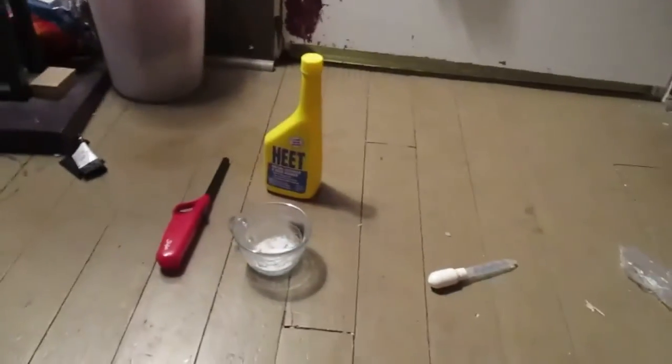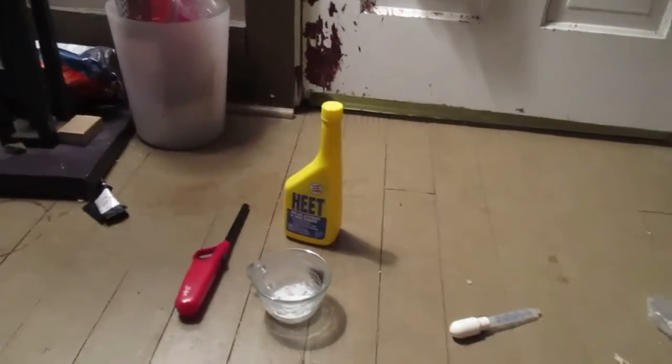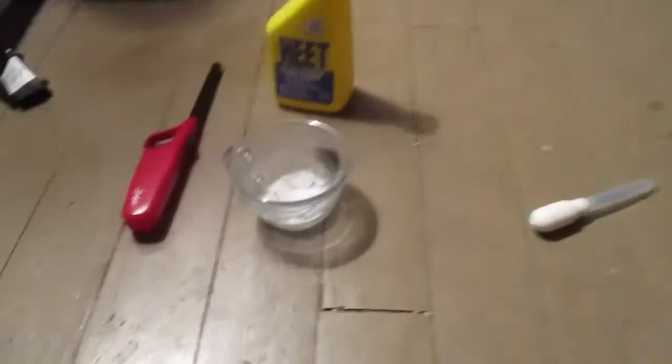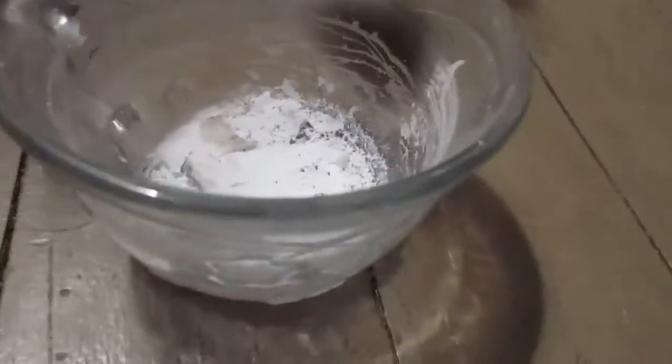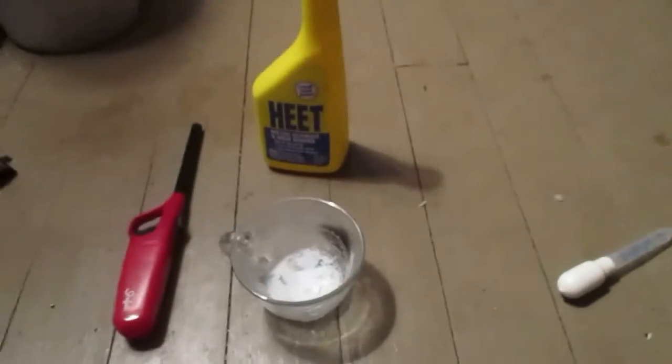Metals — a lot of their compounds will color fire, or the metals themselves will. Lithium is really awesome, and this white stuff here is lithium hydroxide, because I reacted lithium with water in a previous video. I let it sit out over a couple nights and it dried out into this white shiny crystalline lithium hydroxide.